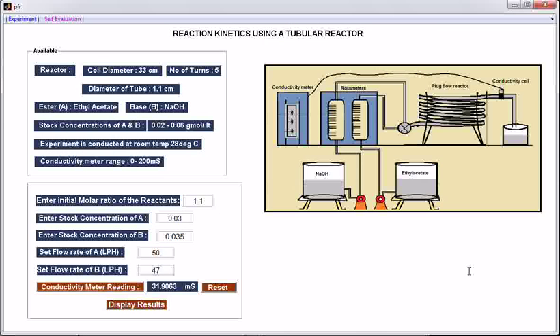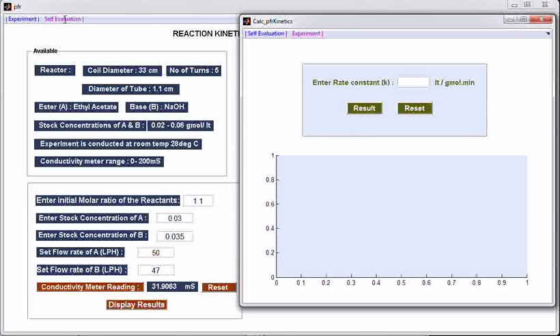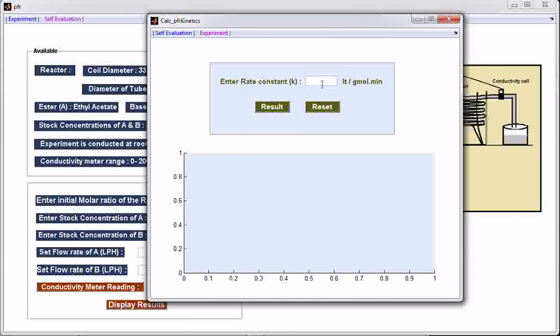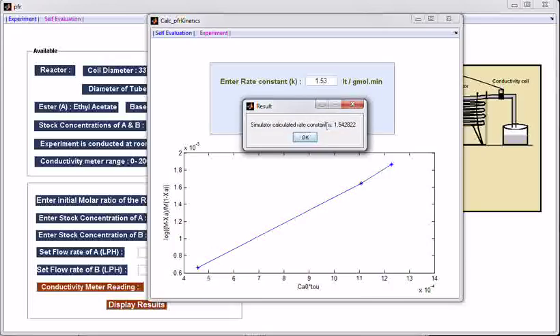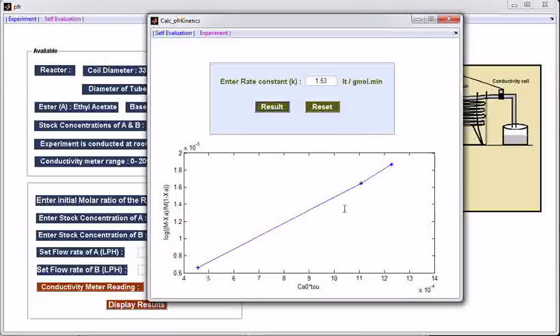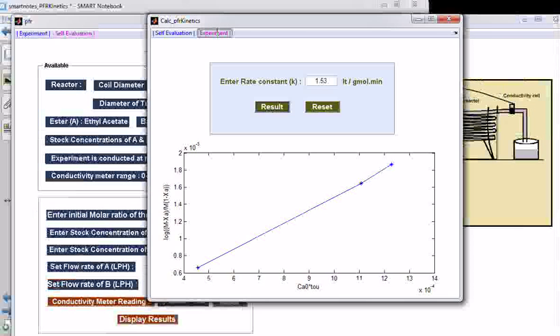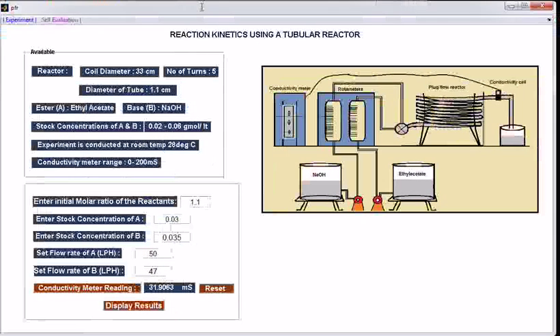After calculating the reaction rate constant, one can cross-check the value with the simulator-calculated value. Go to self-evaluation and enter the rate constant — enter 1.53 — then click the button 'Result'. The simulator-calculated rate constant is 1.54, which is almost the same. This is how the plot looks. At any point, if you want to go to the experiment window, click 'Experiment Window'. These windows can be resized. Thank you.